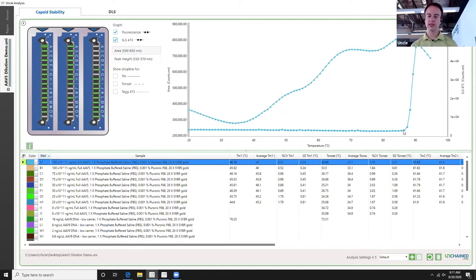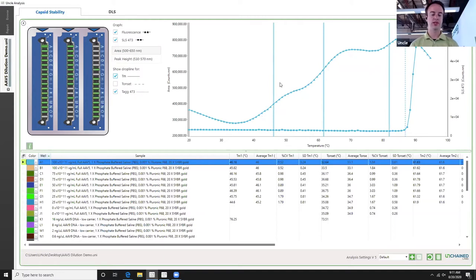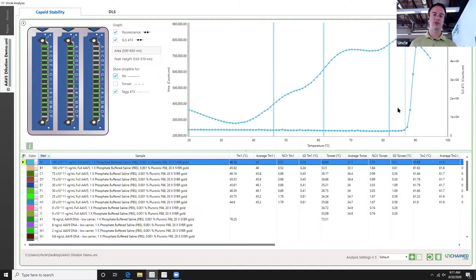I don't see much aggregation behavior happening until about 85–88 degrees Celsius, where I can check this box and see where UNCLE has identified a T-AG — the onset of that aggregation behavior. Adding the TM tells us where inflection points in this curve are. With this one result, I get a very nice picture of the inflection points as DNA was released from capsids — those are the TMs shown as solid bars. Then the aggregation temperature that happens when the capsid is unfolded — we can pair that with knowledge from a TM and T-AG experiment, understanding that this capsid had protein integrity loss at about 86–87 degrees Celsius, which is where aggregation occurs.